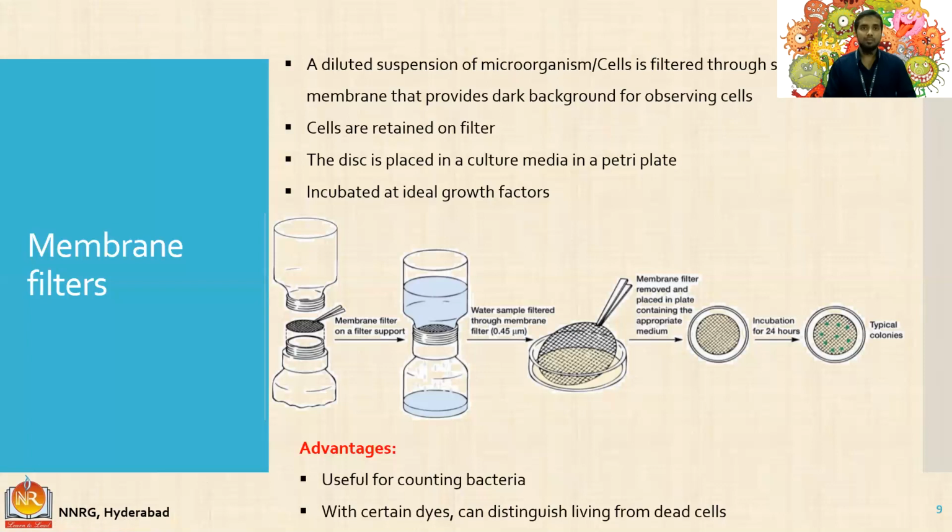And as discussed, the viable count methods are similar to the pour plate and spread plate techniques. For that reason, I haven't dealt with them. It is similar in that after we incubate, we will be able to see the number of cells that are present after we stain them. Okay, and this is it for today's class.